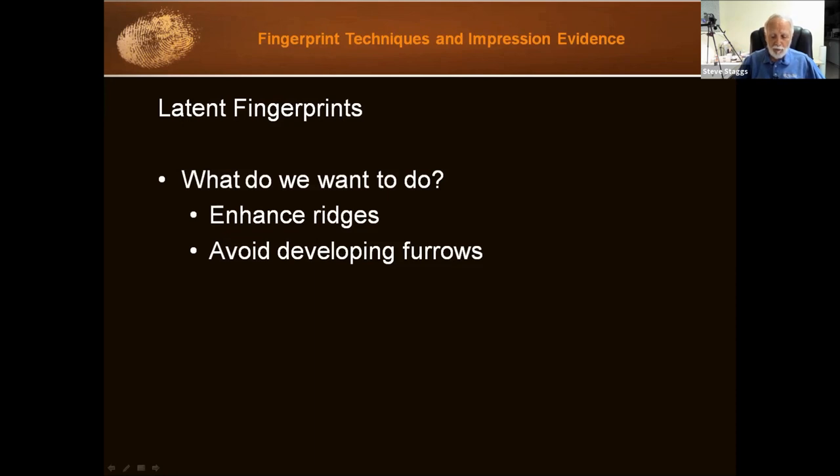We want to apply enough powder to enhance the ridges so we can see the ridge detail, but we don't want to put on too much powder because then we'll start filling in the furrows — the space between the ridges. So there is a fine line there. Don't let that scare you, because this is incredibly easy to do. Maybe your first lift you'll have too much powder or not enough, but after two lifts you start nailing it every time.